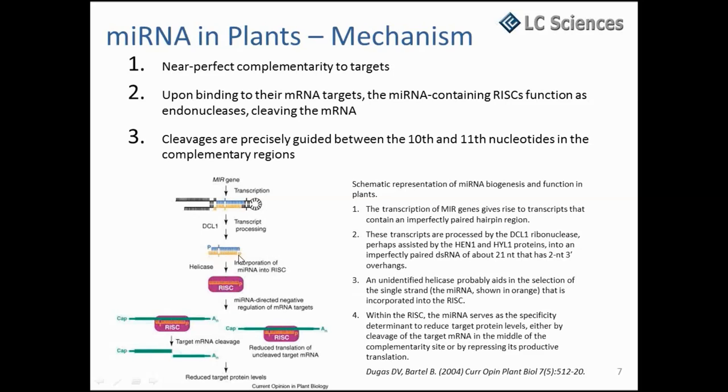I mean, the microRNA precursor is transported outside the nucleus, and then it will form a complementary pair with the messenger RNA. This messenger RNA will be the target of the RISC, and will be cleaved by the RISC into two parts, upstream and downstream. On the downstream part, they keep the phosphate ion. That's very important for our following protocol of the degradome sequencing.